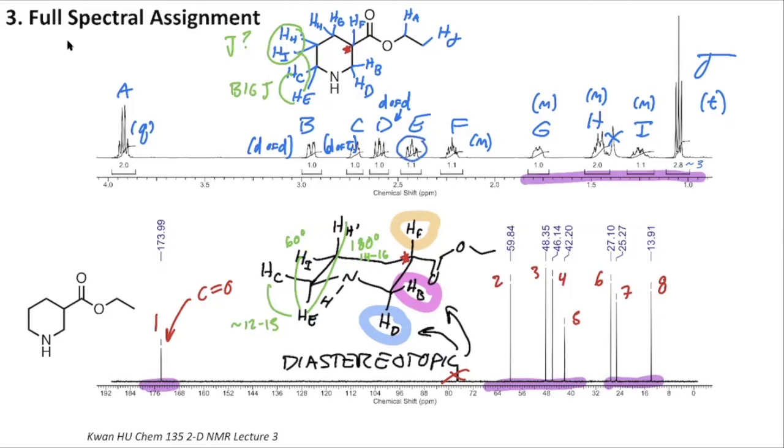It's hard to see on the central peak, but I think on either side here or here, you can see a little bit of fine splitting to it. And I think that is happening in the central peak as well. It makes it look to me like it's presenting as a triplet of doublets. So again, big J first, triplet, and then doublets is the small J, a triplet of doublets. So there's a little bit more practice on looking at fine detail splitting in the one-dimensional NMR.